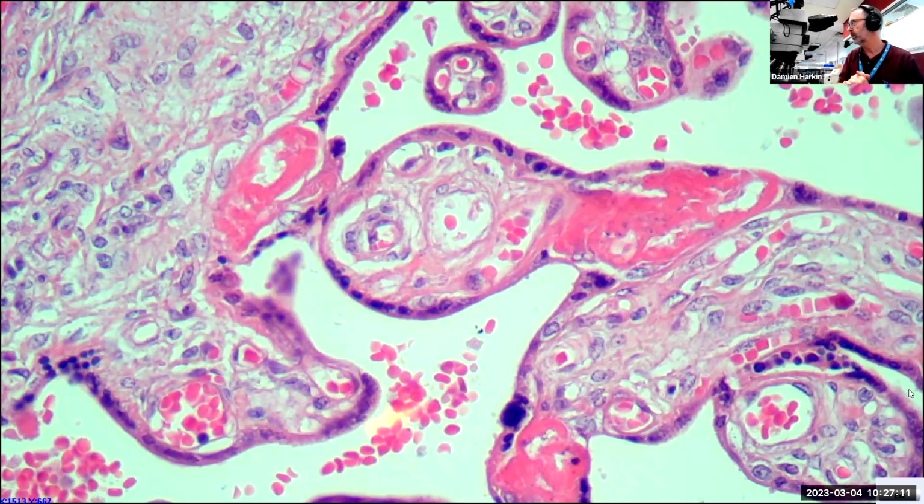We had some liver tissue which had formalin pigment, and it was quite a diseased piece of liver, with quite fatty changes within the hepatocytes. As the fat had been removed, there were these spaces that were created. And what we could see is these browny yellow, almost needle-like structures that were residing within those spaces.